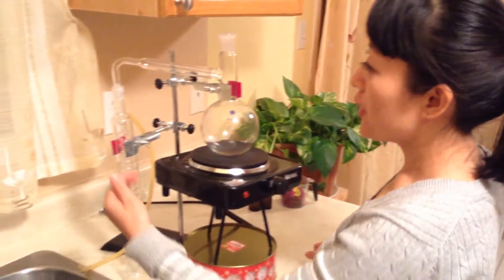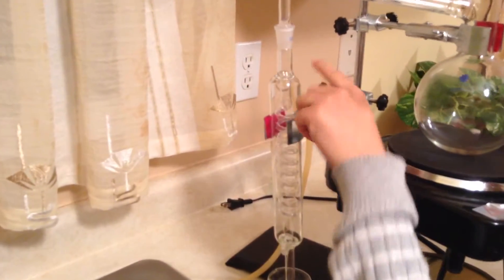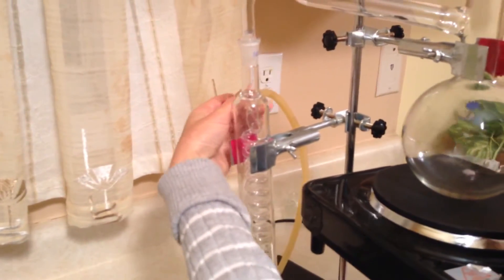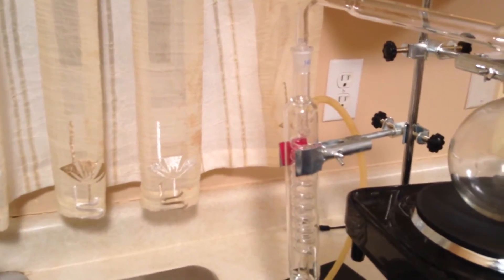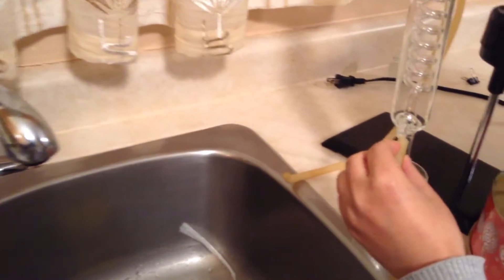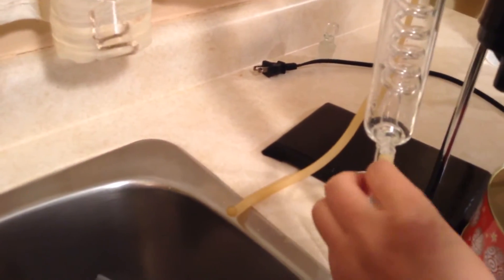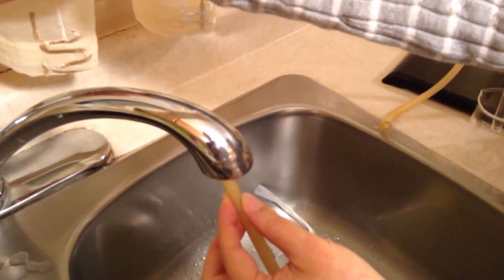We have two tips to share with you. You can see this condenser — it has two nozzles. We need to attach the rubber tube onto them. If you want to put the rubber tube on the nozzle, sometimes when it's dry it's hard. Look here — it's hard to tap on. So, just put a little bit of water on it to make sure it's smooth.